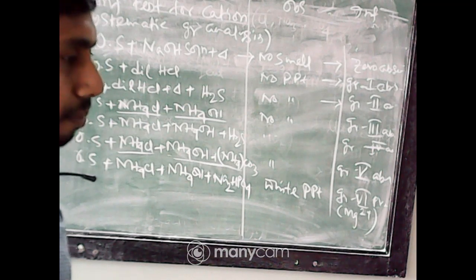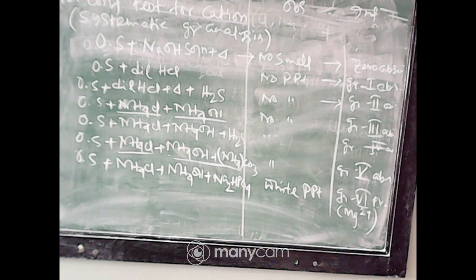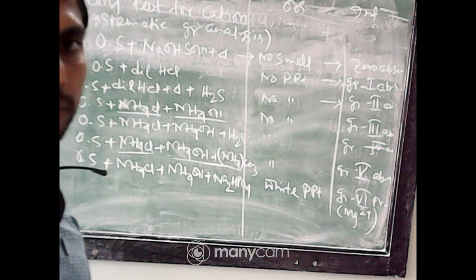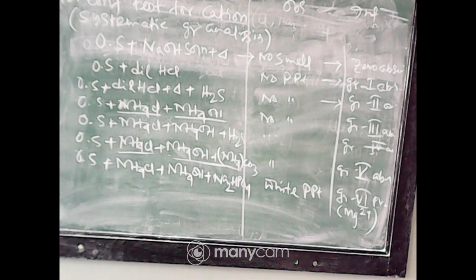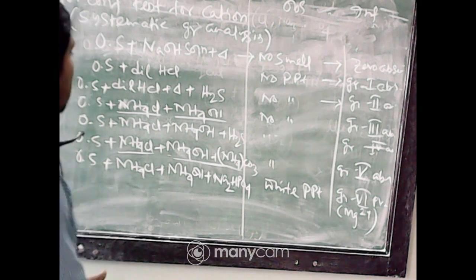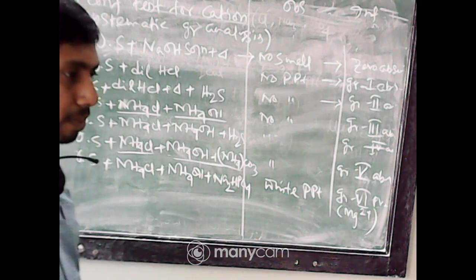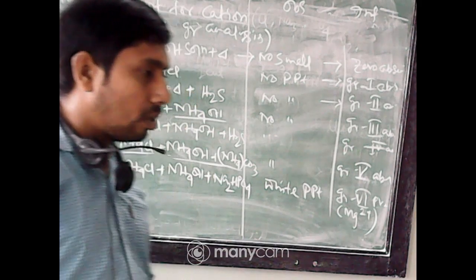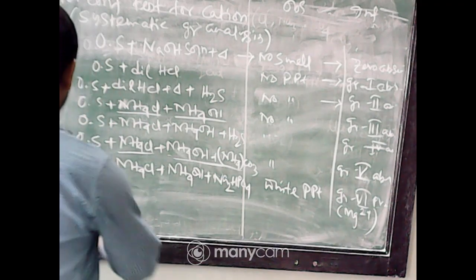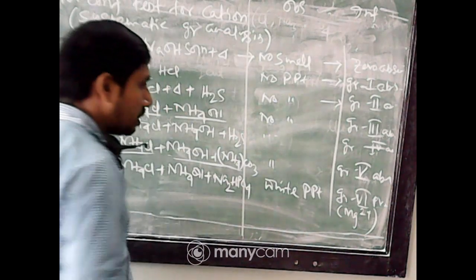Suppose you got calcium, then you have to write that barium is absent, strontium is absent, then you have to go for calcium. As from left column to right column you will move. Okay, so I think it is clear to everyone how to write this part. And when you write those two experiments, or you confirm that one, after that the table is completed. Then at last you will write the conclusion that the supplied sample contains this cation.